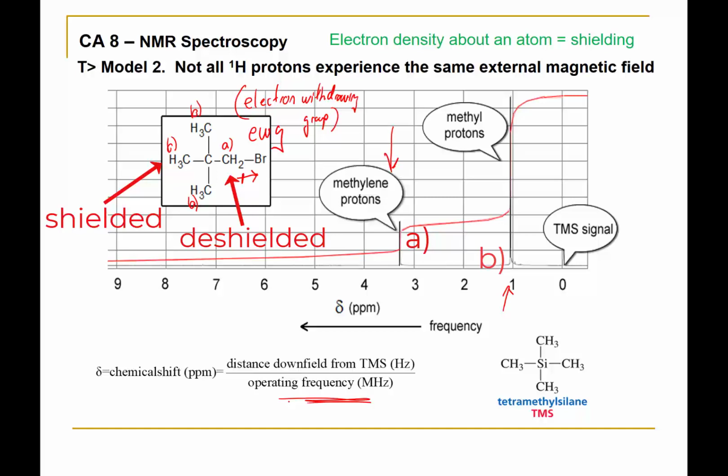Again, in order for NMR from different instruments to be compared, there's a standard that's used. Nowadays, the instrument actually doesn't require a standard to be put into the instrument, but rather it's done electronically. But in the early days, this standard actually had to be included. Now, how does this standard work?